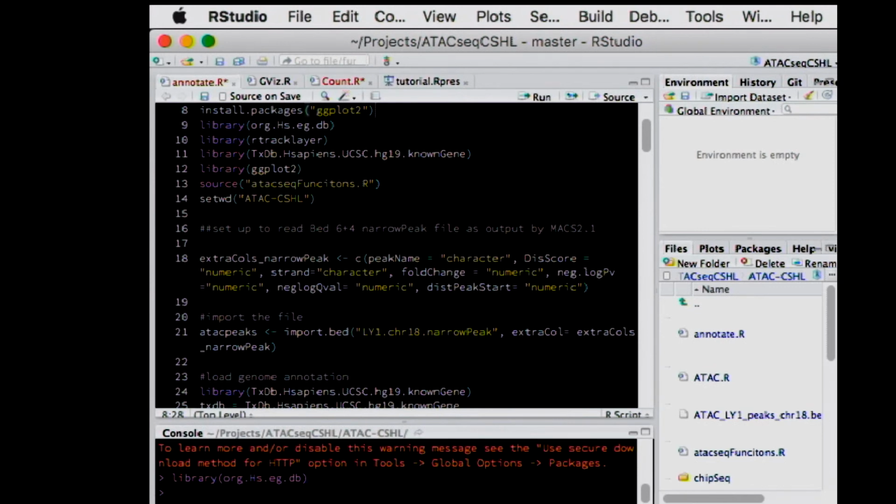But before getting to that stage, we have to sort of process the data. So we get back paired-end sequencing, right? We're going to pick up sort of at that annotation point, but maybe someone can say, so we get all these sequencing reads back, right? Like FASTQ files, then what do we do? Like from there? Right, even before that, like QC, yeah, align. Yeah, you could do QC now or probably after, but yeah, align.